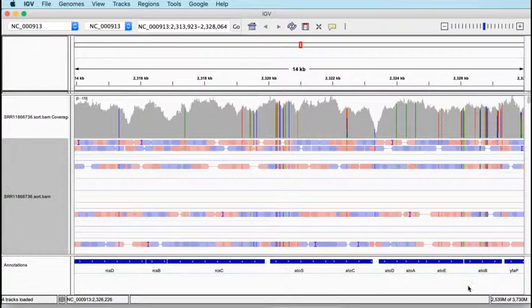So in a stranded RNA-Seq experiment, you should see blocks of the same color for reads that all align to the same gene. If you see a mix of colors, pinks and blues within the same gene, that will usually tell you that the experiment was actually unstranded. That's not very common anymore, but it can be quite a useful thing to visualize.